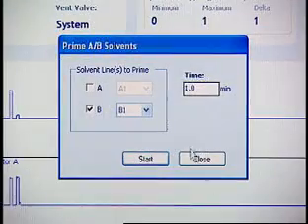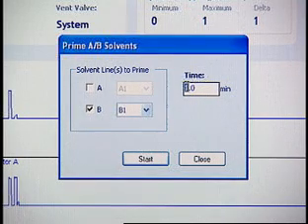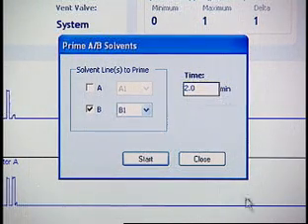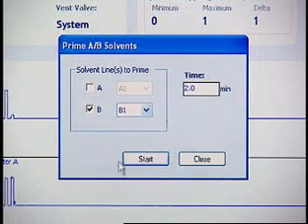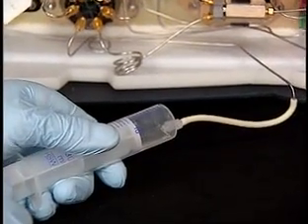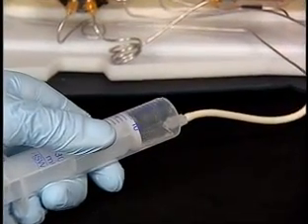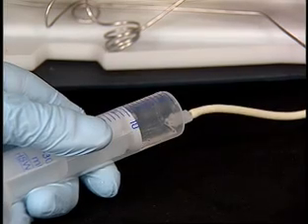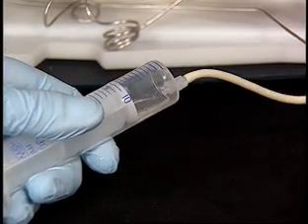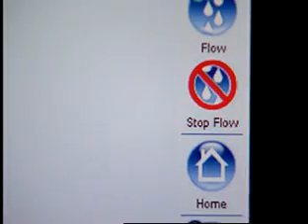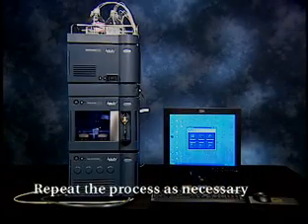In the Time box, enter 2 minutes. Click Start. Withdraw the syringe plunger to draw solvent through the solvent path. When solvent flows out of the vent line, the path is primed. Stop the solvent flow. Repeat the process as necessary to prime other solvent paths.